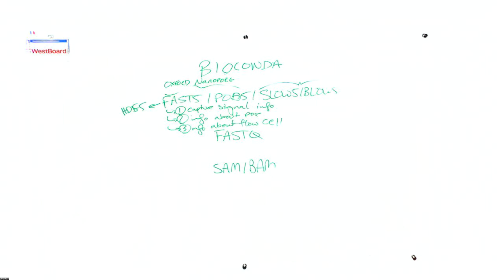How many people are familiar with JSON files? Have seen a JSON file?